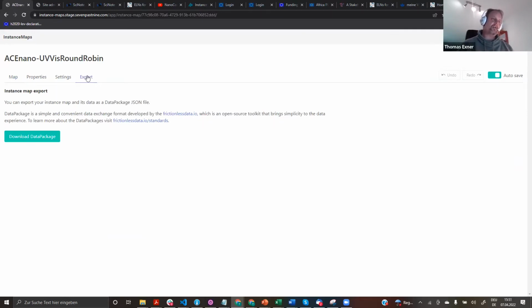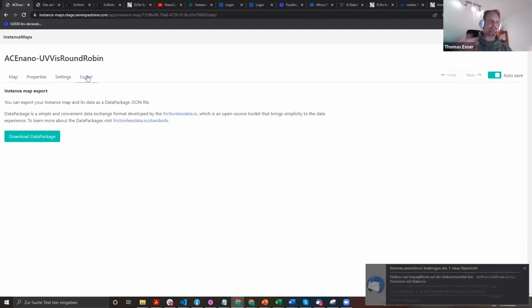It's not perfect yet, and it's also not storing the actual data files. You have to do that manually. Therefore, we are doing that, but that is actually the final idea: you click a button, this whole thing will put everything together and pack it into a package, which you can then put on a data repository, Zenodo, whatever, or your institutional one.